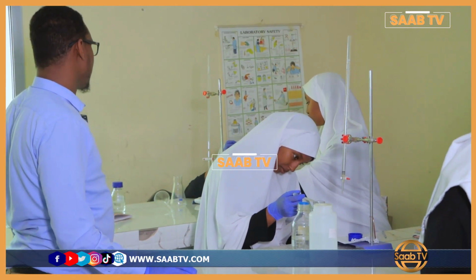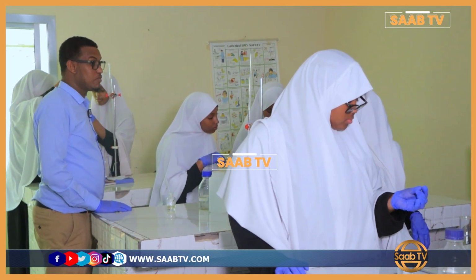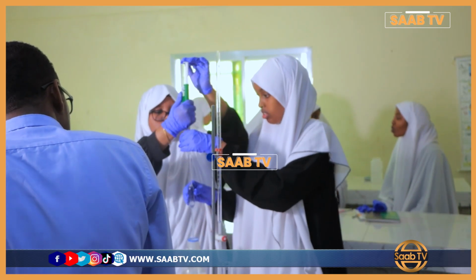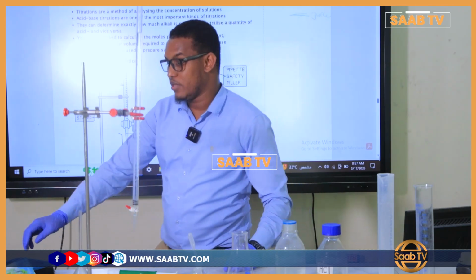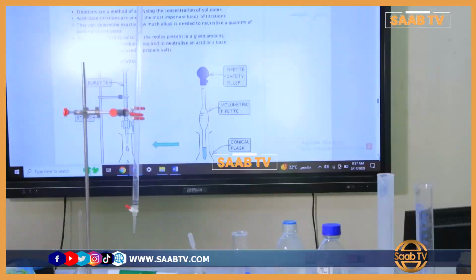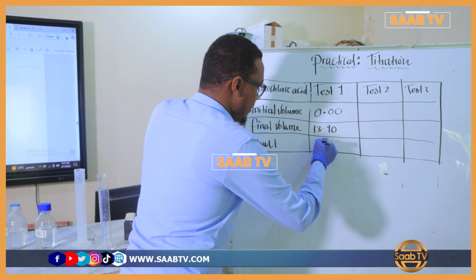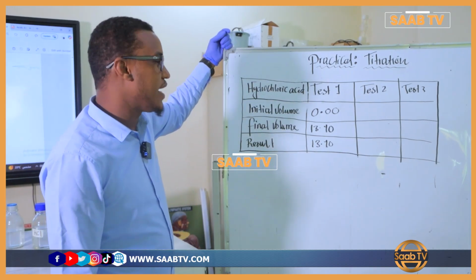So then we stop the tap and then we read the final volume. When we're reading the final volume, we're going to use the eye level to observe it very well. So we have 13.1. 13.1 for the final volume. Let's subtract the final volume minus the initial volume. So it will be 13.10. So we have done the first test.